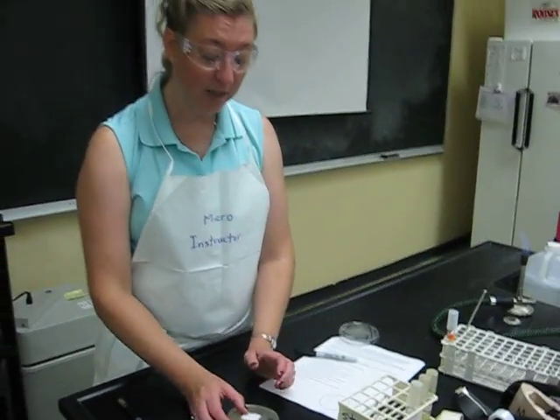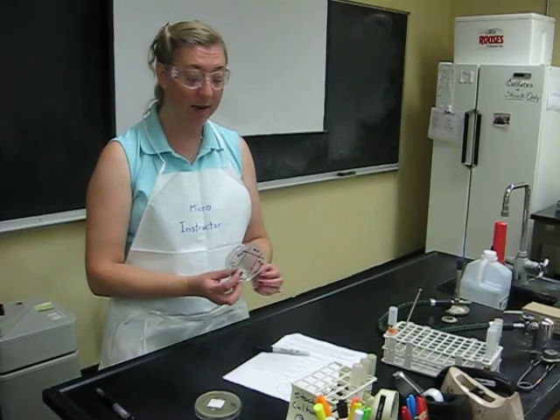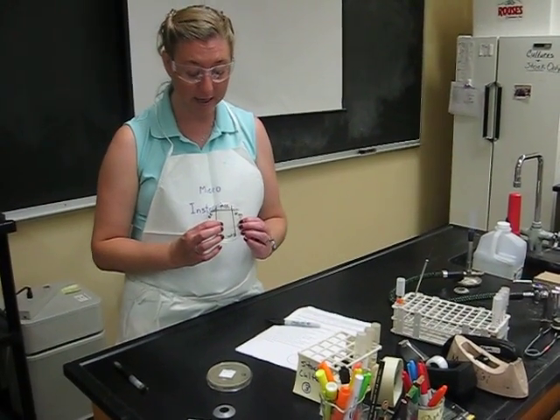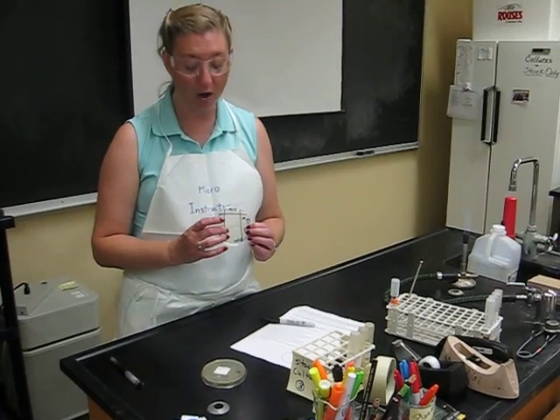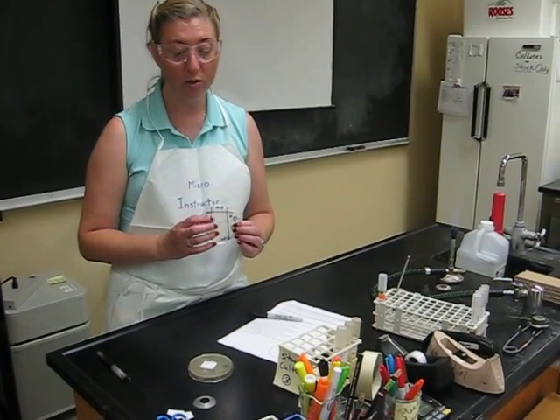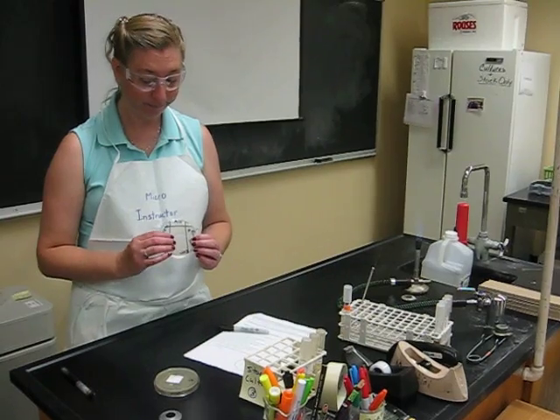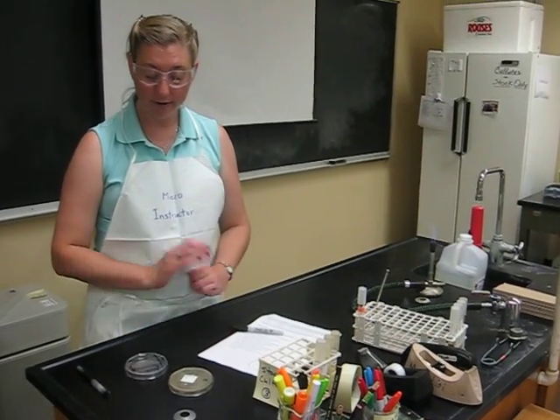And that's what we're trying to obtain here. We're trying to separate the mix out. So we have two bacteria. So hopefully we'll end up with two slightly different looking colonies for the two different bacteria that are in this sample. Put it in the incubator and we'll find out next time. Bye.